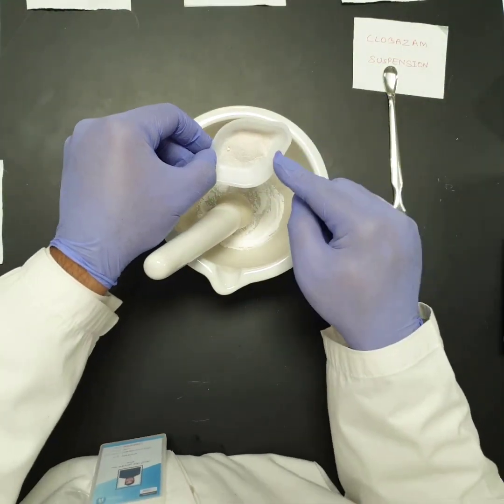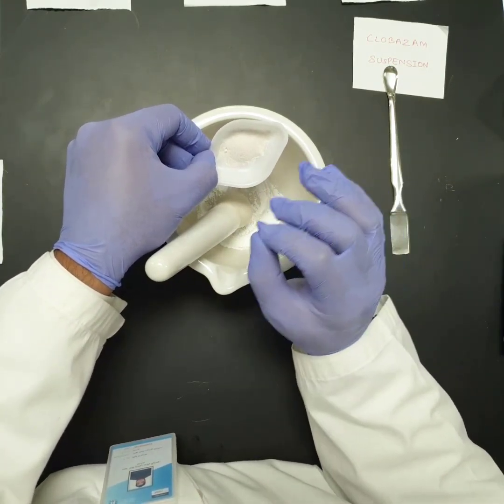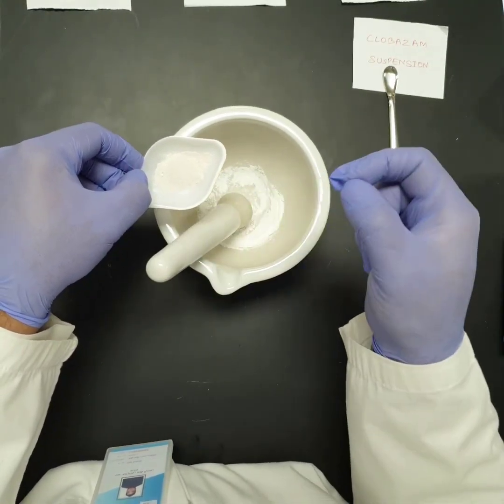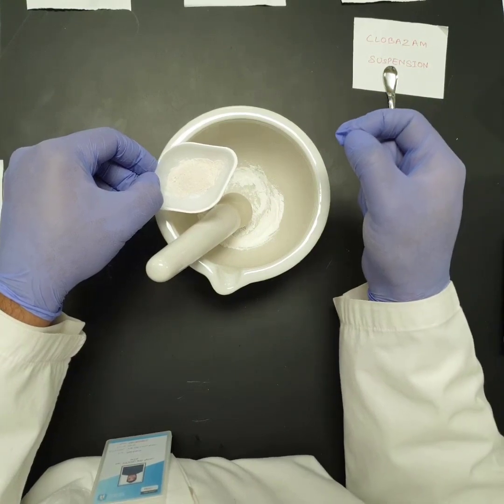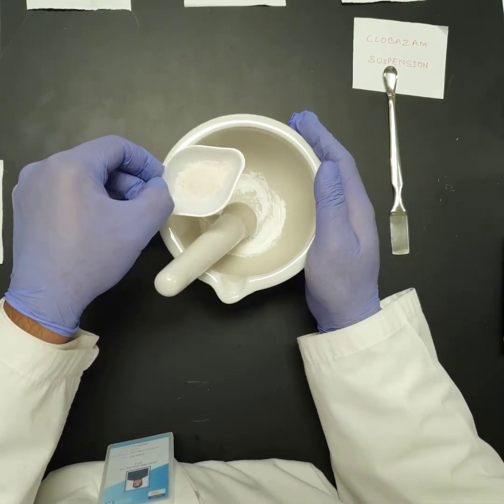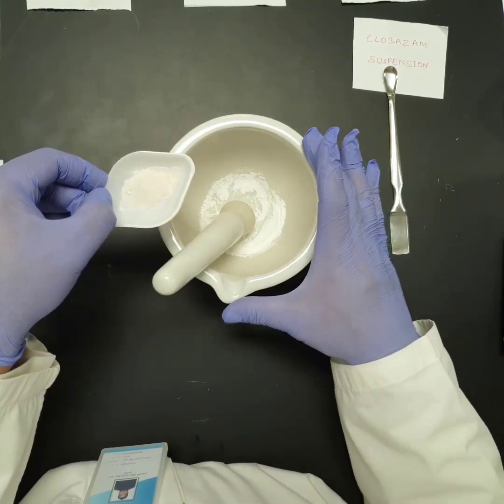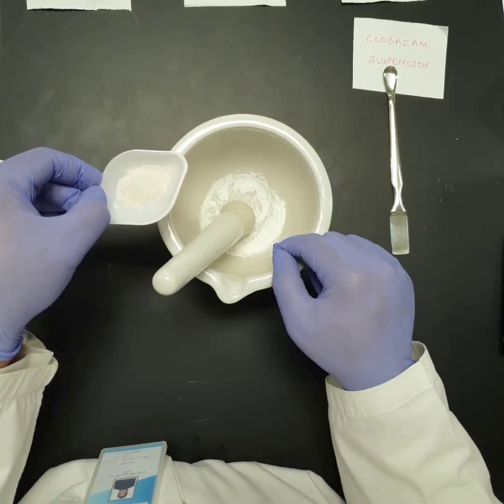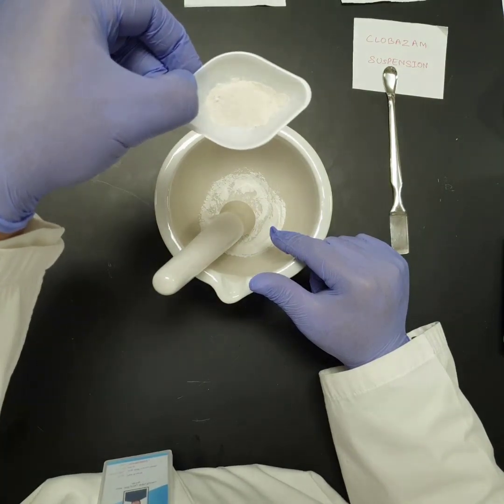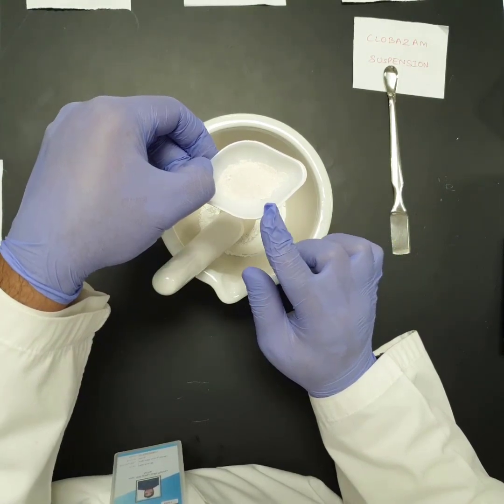If I add all this suspending agent to the porcelain mortar, it will be wrong, because I have to add these two powders with the geometric mixing technique or doubling up technique. In that technique, first of all, we have to take the smallest volume of the powder. In this case, we have 100 milligram of clobazam powder in our porcelain mortar, and we have 1 gram, which is equivalent to 1000 milligram, of suspending agent in the weighing pan.